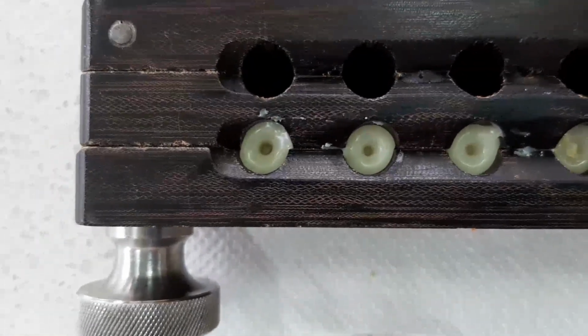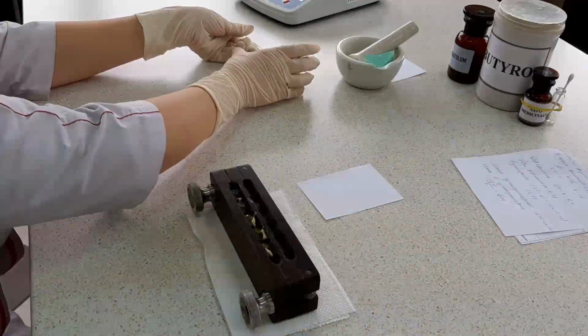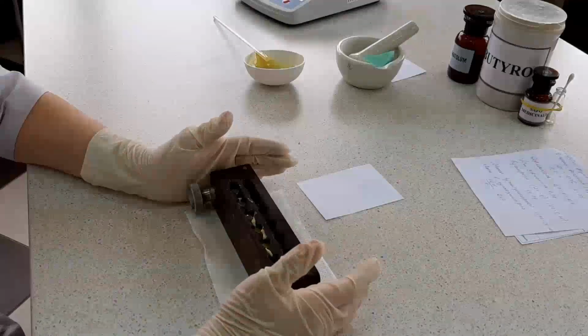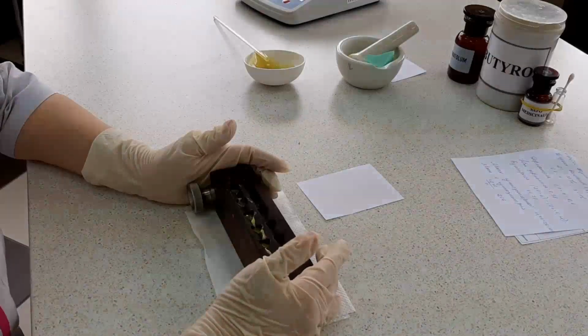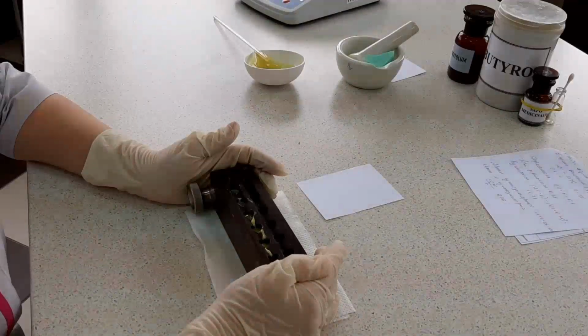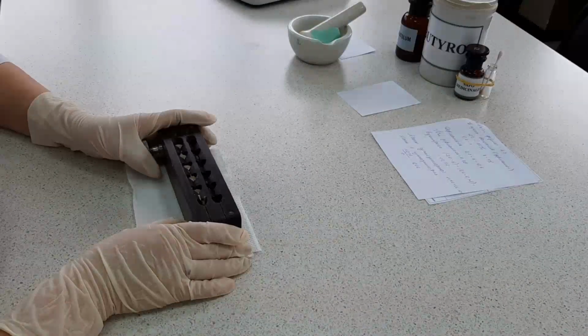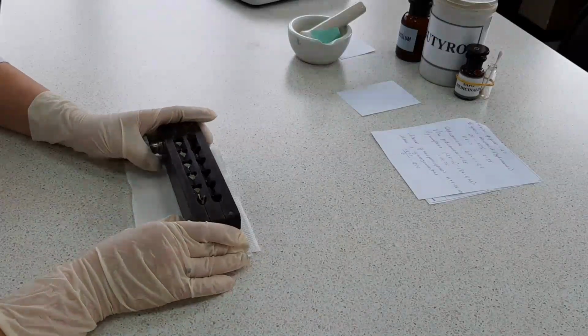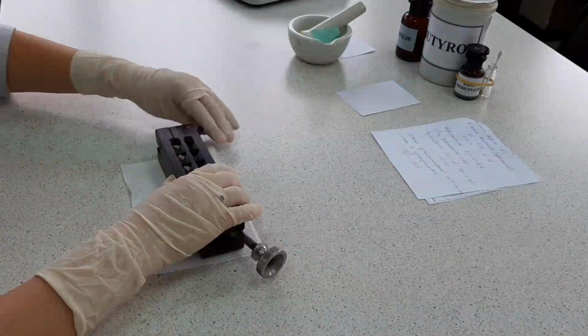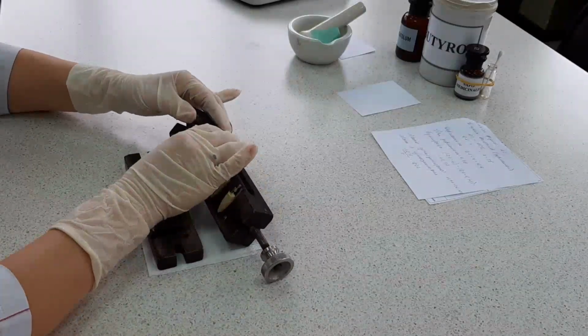Place the mold in the fridge for 15 to 20 minutes to completely solidify the suppositories. After cooling, remove the mold from the fridge, disassemble it, and carefully remove the suppositories by pressing on their tops.